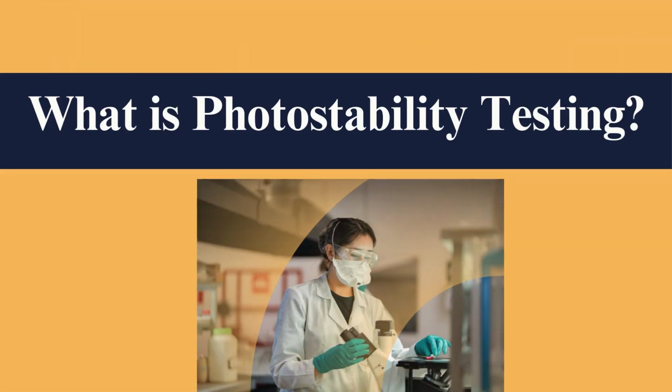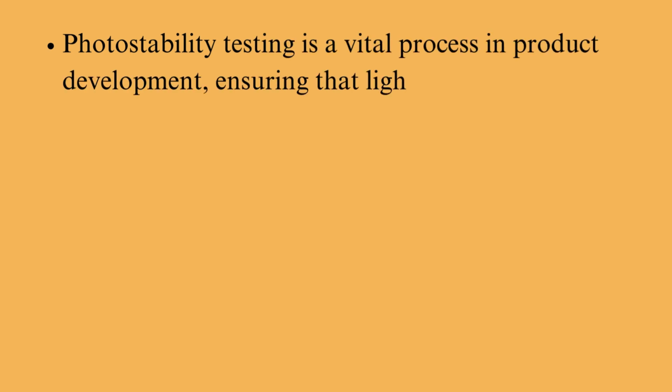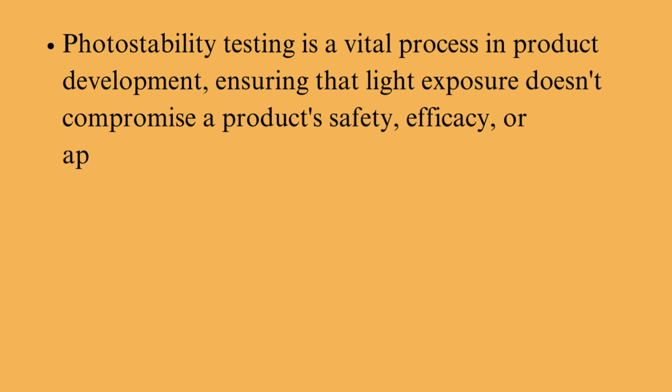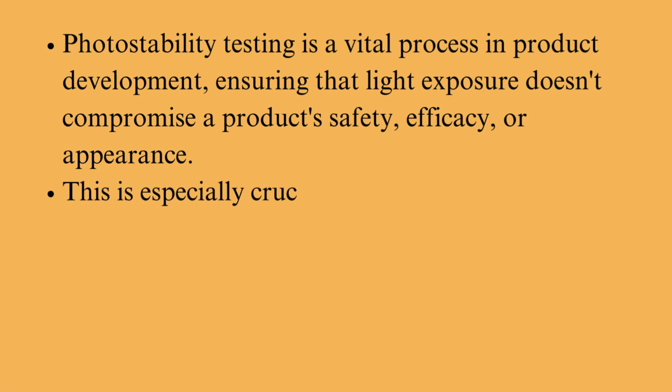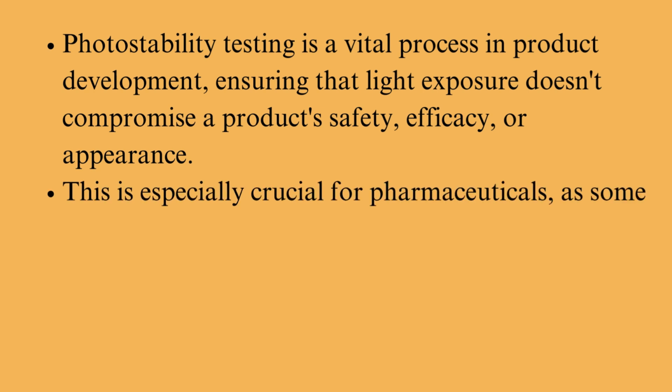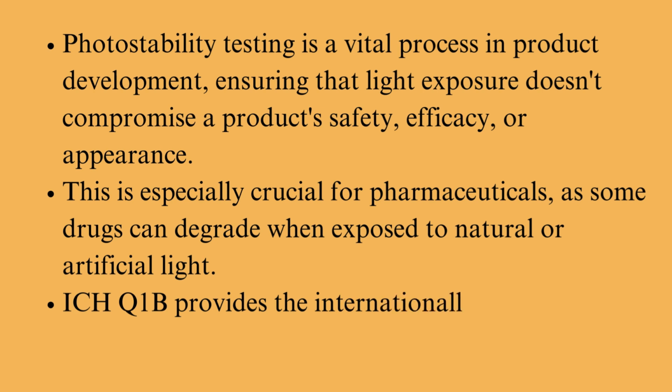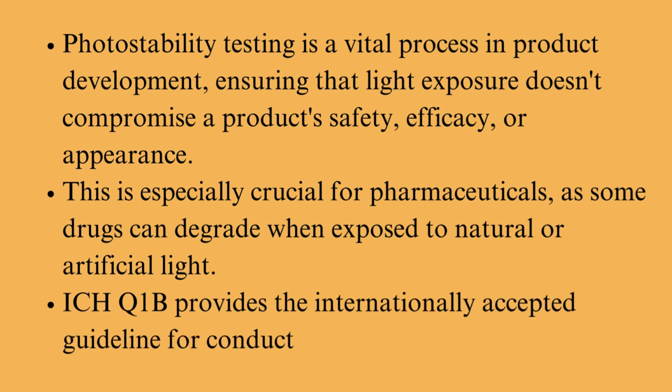What is photostability testing? Photostability testing is a vital process in product development, ensuring that light exposure doesn't compromise a product's safety, efficacy, or appearance. This is especially crucial for pharmaceuticals, as some drugs can degrade when exposed to natural or artificial light. ICH Q1B provides the internationally accepted guideline for conducting photostability studies.